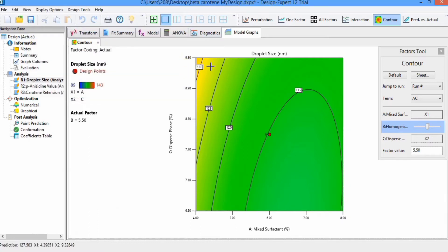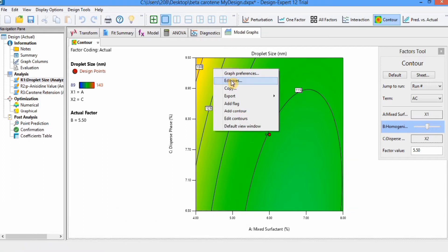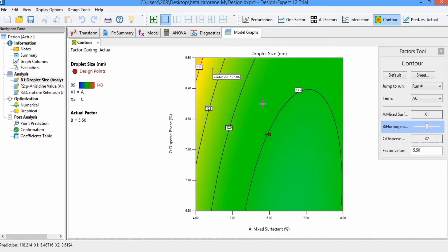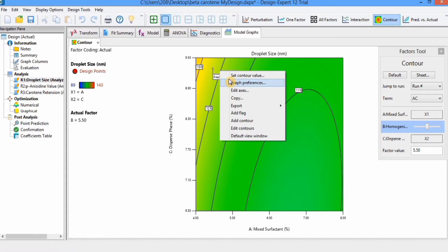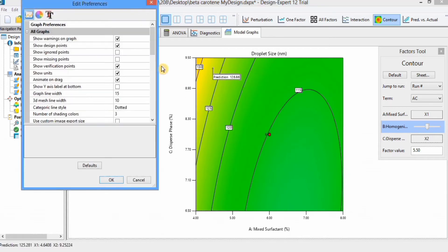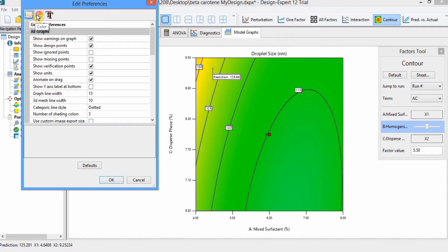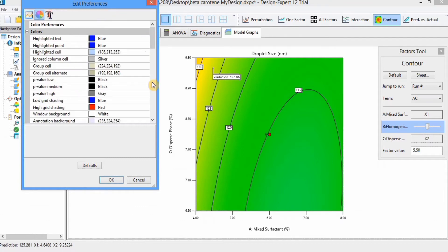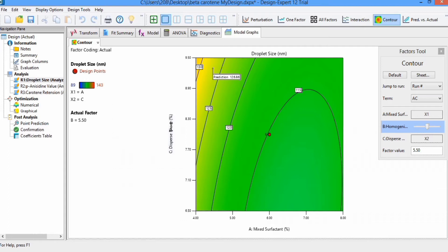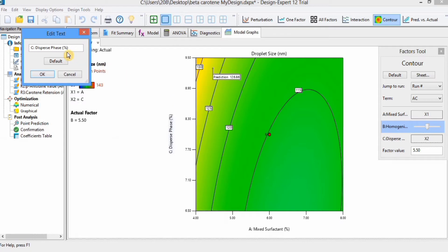Another option is to right-click on this graph and click Add Flag. You can see that a flag will appear here. Then right-click again and you will find different options such as Set Control Values and Graph Preferences. If you click on Graph Preferences, you will find plenty of options for editing the graph, including font editing and color editing. You can also right-click to find the Edit Text option to edit the axis labels.